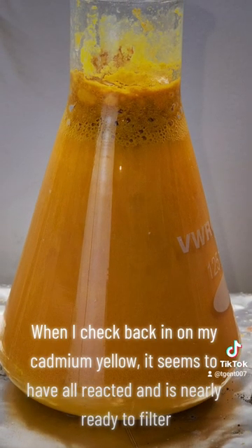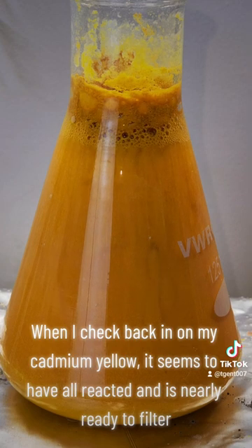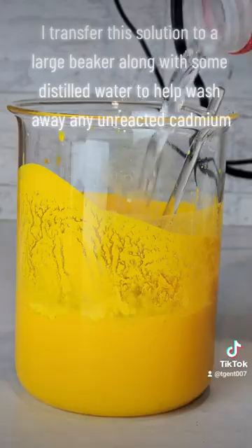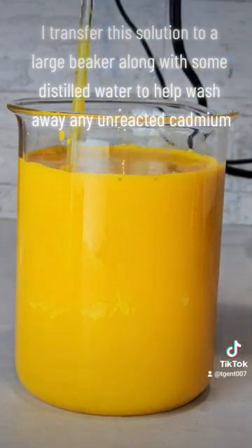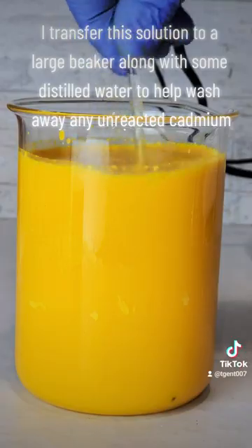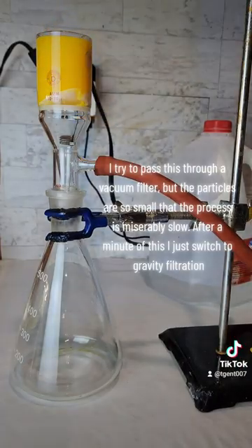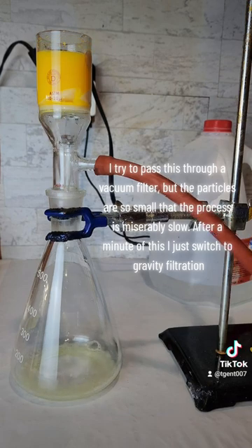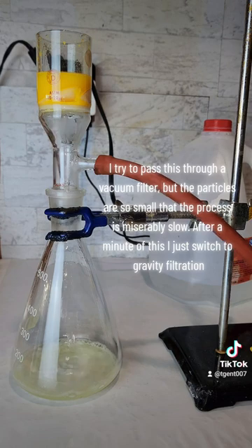When I check back in on my cadmium yellow, it seems to have all reacted and is nearly ready to filter. I transfer this solution to a large beaker along with some distilled water to help wash away any unreacted cadmium. I try to pass this through a vacuum filter, but the particles are so small that the process is miserably slow. After a minute of this, I just switch to gravity filtration.